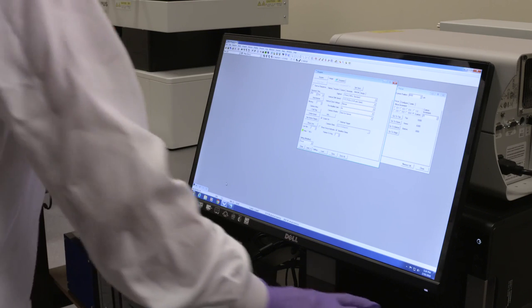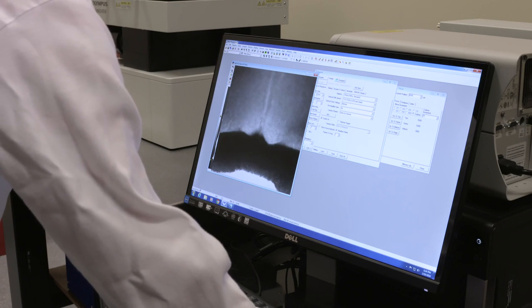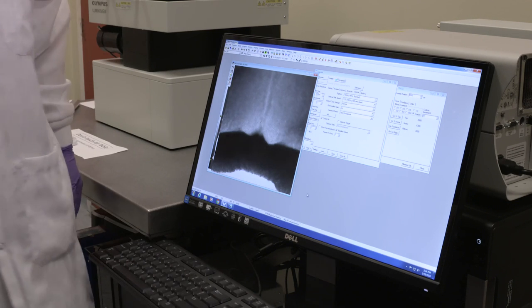At first, we check the focus of the microscope on the SCN with the lights on using bright field imaging. Once that is set, we now keep the cell in total darkness except for the light produced by the luciferin-luciferase reaction.